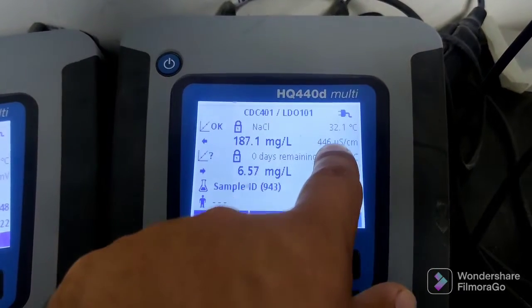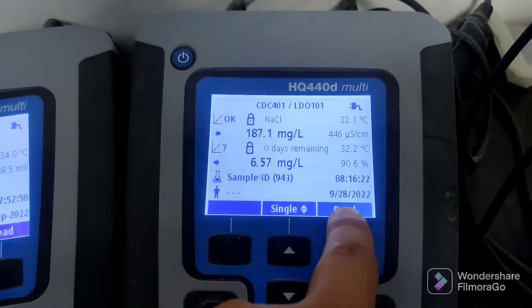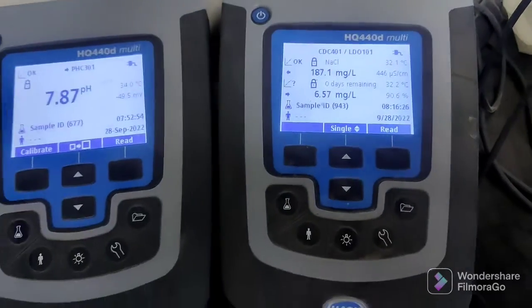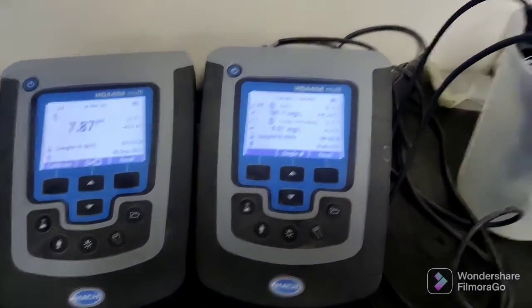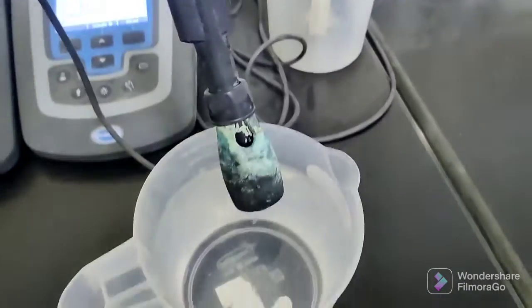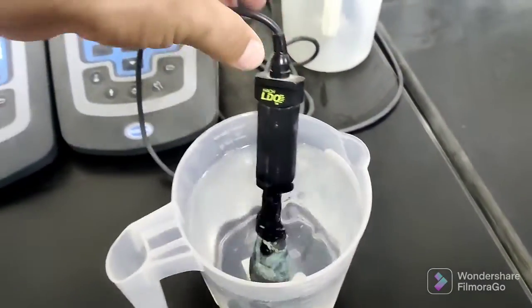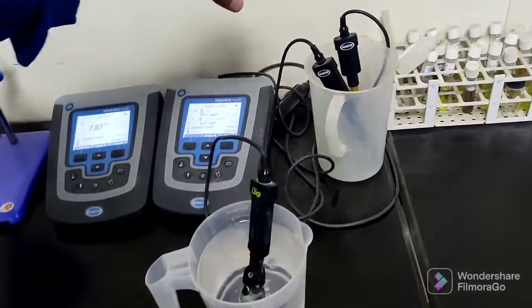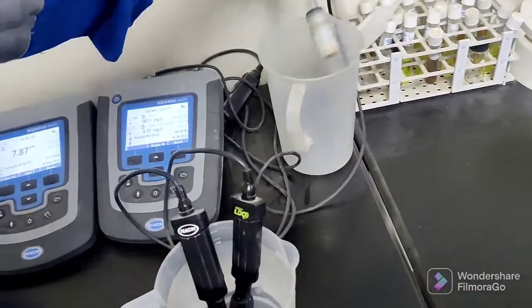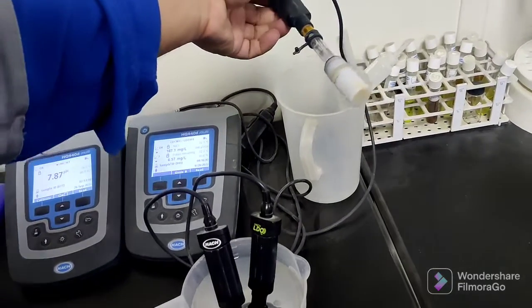This one also shows temperature. The first one is showing the conductivity and the DO. This unit is showing milligrams per liter — how many grams — this one is the conductivity. And this one is for the DO, dissolved oxygen. We are checking the water: the pH, dissolved oxygen, and conductivity.